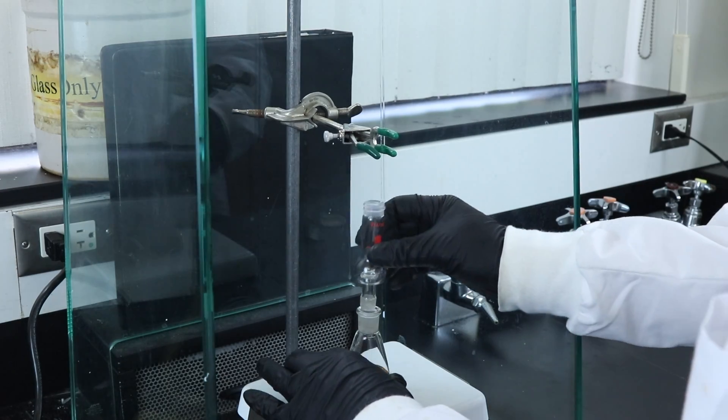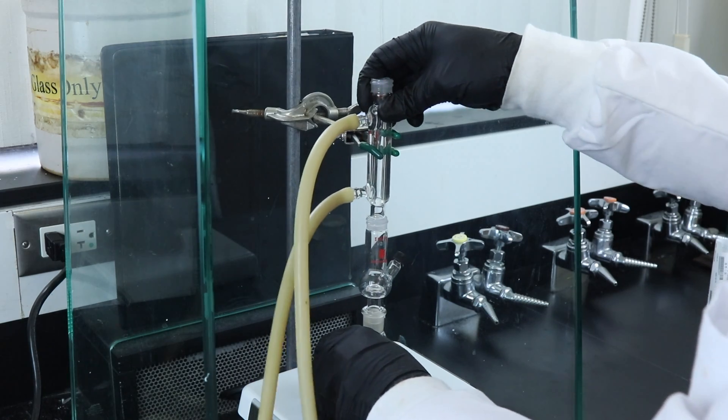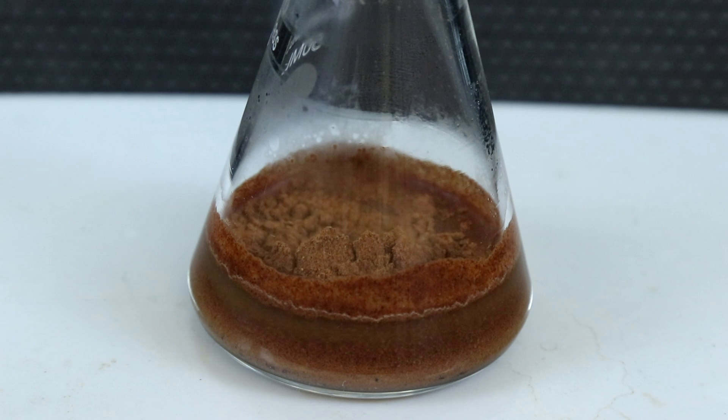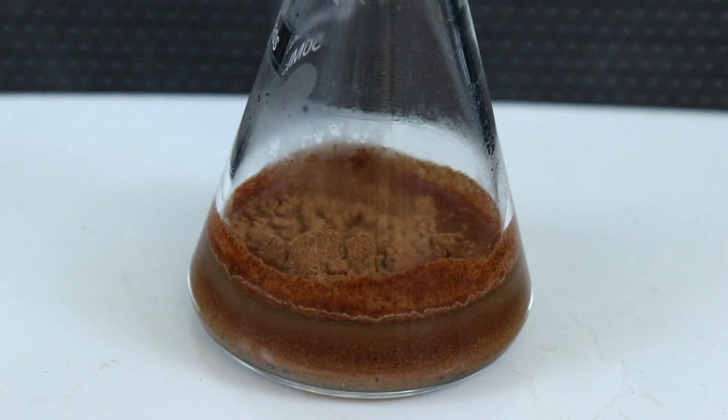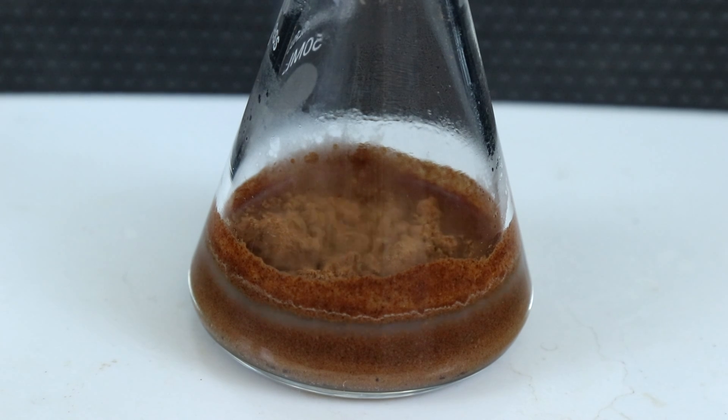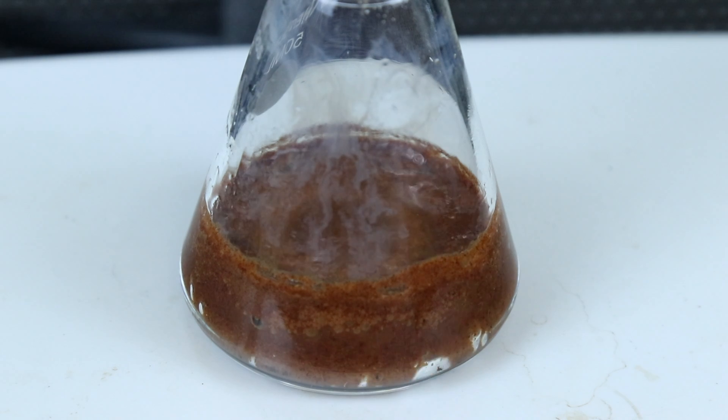Now I'll set up the apparatus attaching the Hickman still and a water condenser on top of the Erlenmeyer flask and then start heating things up. As it does warm up you can actually start to see the milky distillate in the cinnamon, and as that begins to boil we're going to see that a lot more on the sides of the flask.